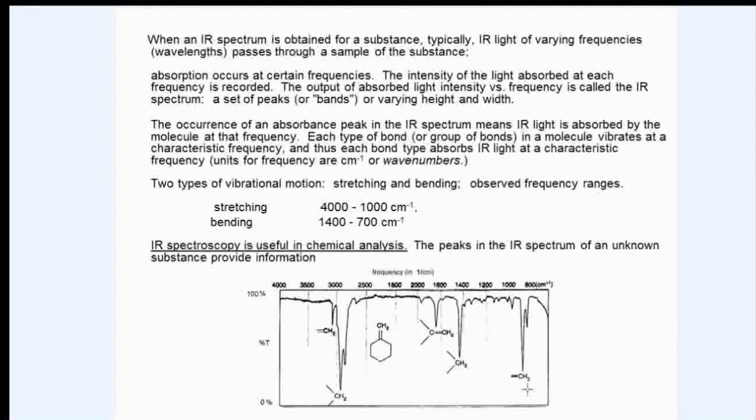It's actually 2 peaks, a bigger and a smaller one. With respect to the bigger one, that's also created by the bending vibration, namely the HCH of the double bond unit. So it's the alkenyl HCH bending motion that is absorbing a photon, creating that peak at about 900 or so wave numbers.